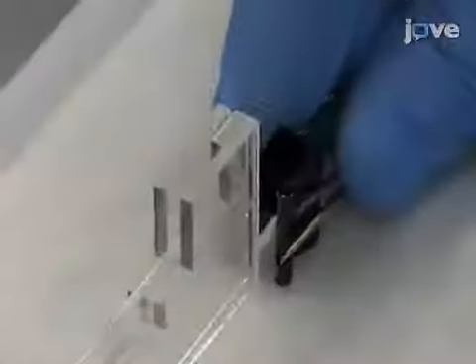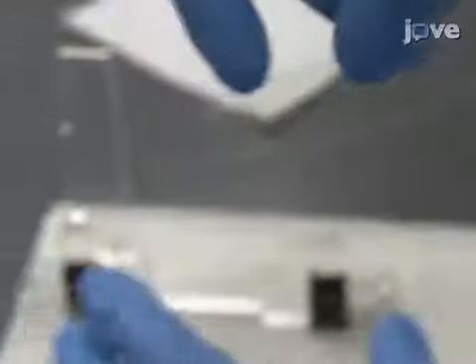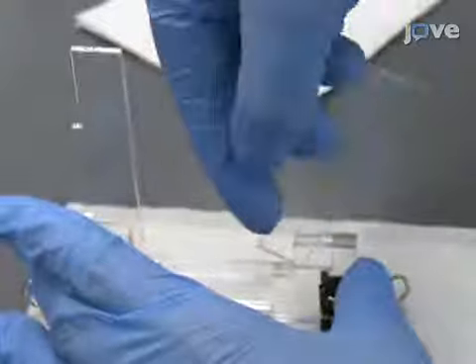Use 2 small binder clips to clamp the base pieces on each side. Place the uprights into the mold, making sure that the laser kerf is correctly positioned.